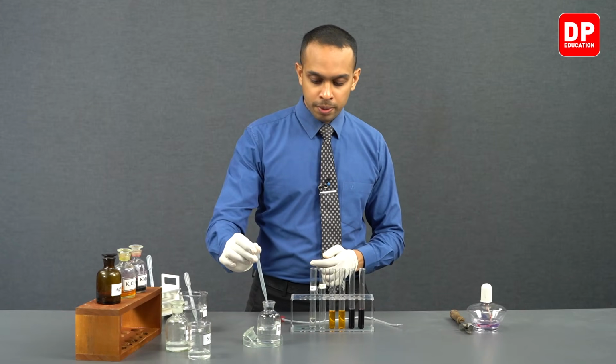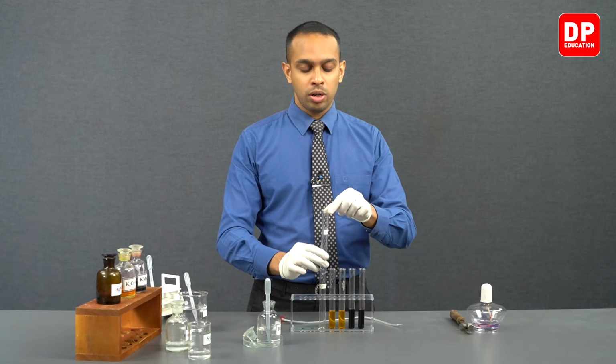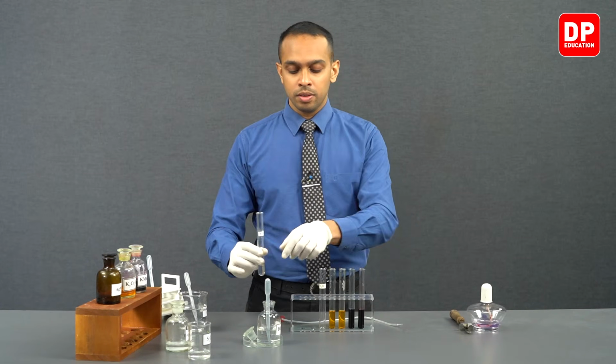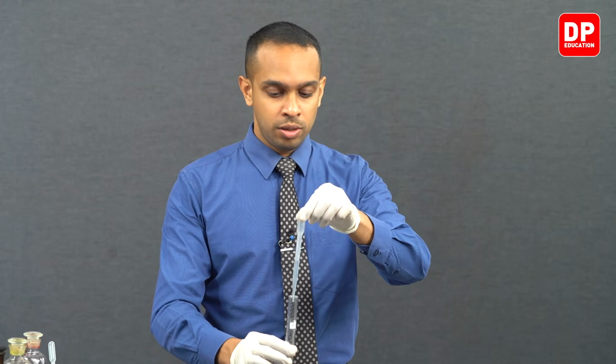And with the help of a dropper, we can add a small amount of HCl to our solution that we have here.